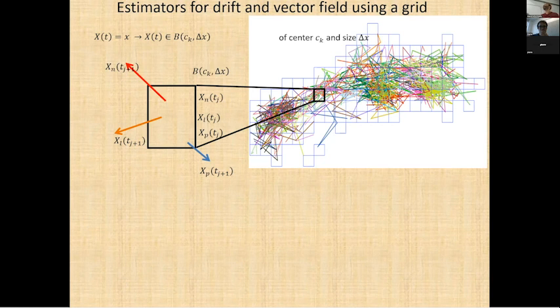Yeah, you assume that you do, for example, PALM, or you tag your receptor. You assume that you have one type of receptor, of course. Otherwise, if you have two different types, you have to do different labeling, two different colors, and then you can have a mix, but you know what you are averaging. You should not average things that are not the same.